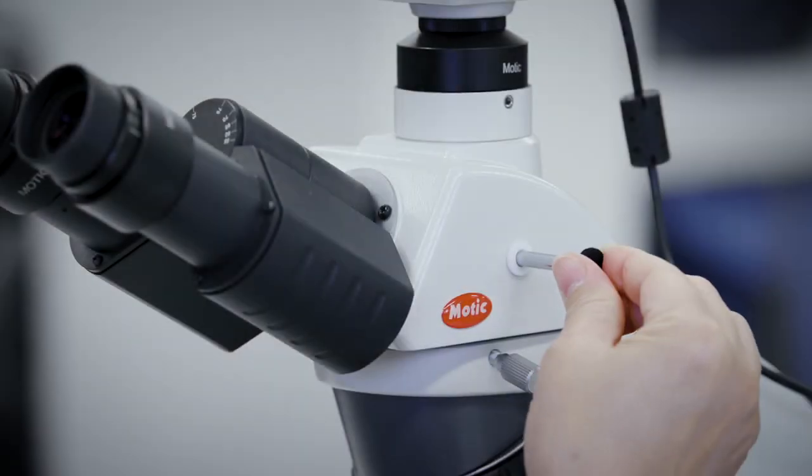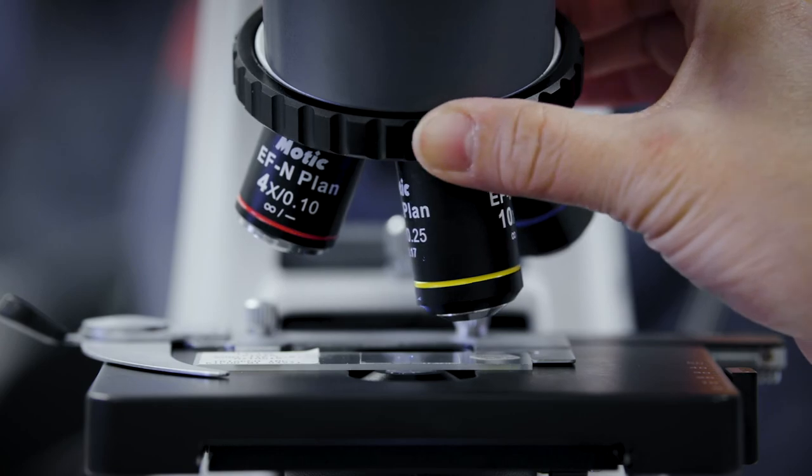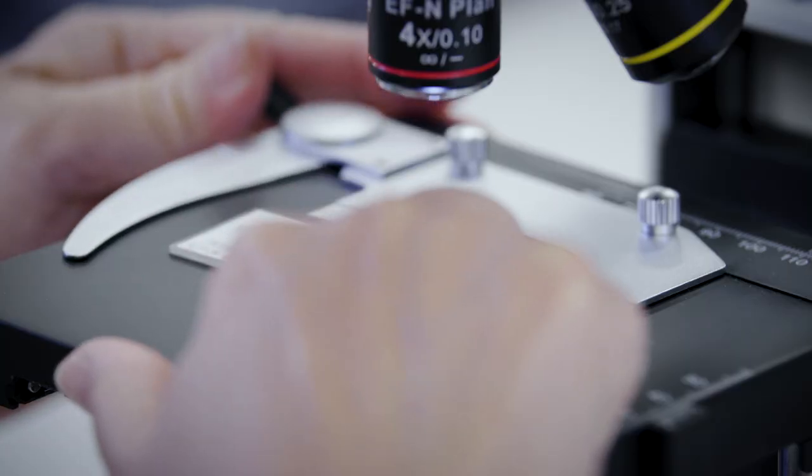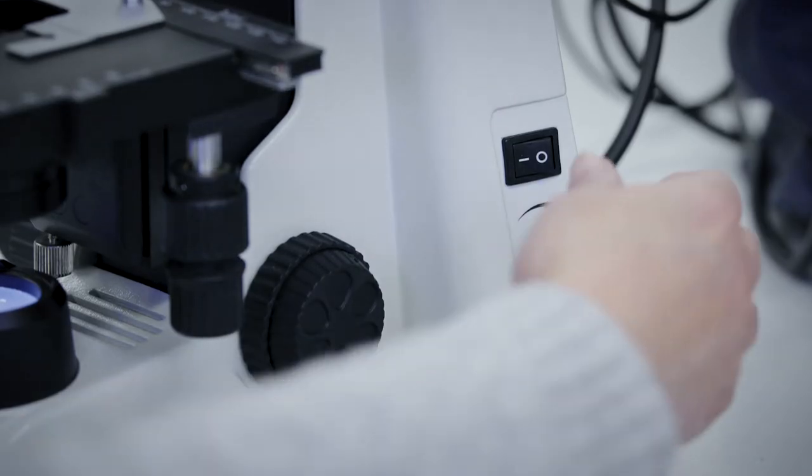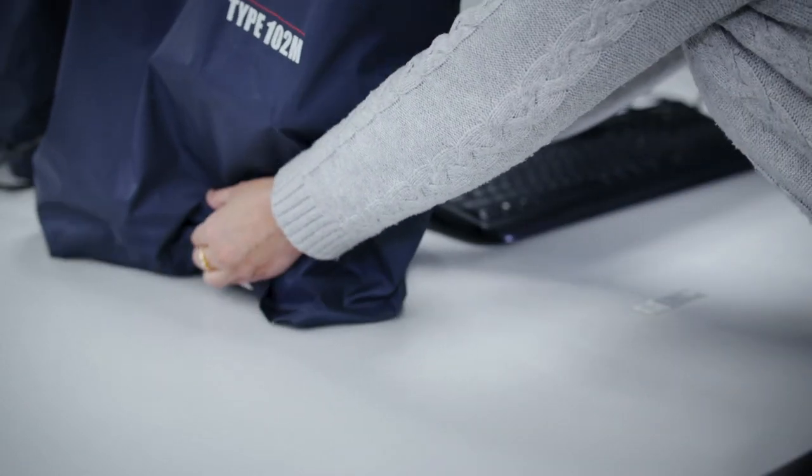When you finish with the microscope, push the camera pin in, set to the lowest magnification, remove the slide, turn the microscope off and put the cover back on. Lift the microscope with both hands and place it back in the middle of the bench.